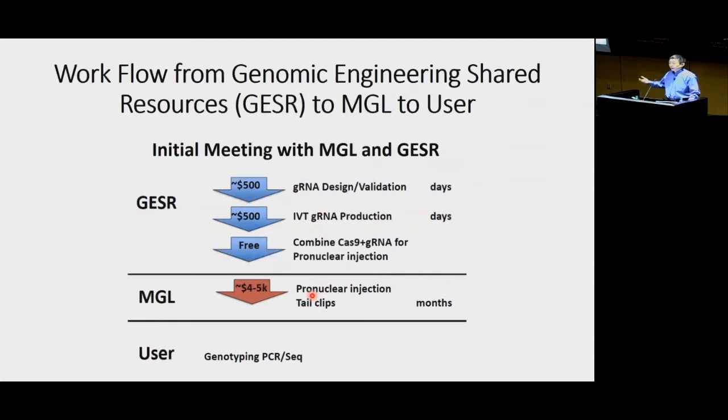And then I need to wait until the mice are 21 days old, and I can wean them. So the entire procedure takes more than 1 month, between 1 and 2 months, before you may get mice. Then I will transfer the mice to your lab, and it takes time for you to characterize them. So mice will take a much longer time than just molecular biology.